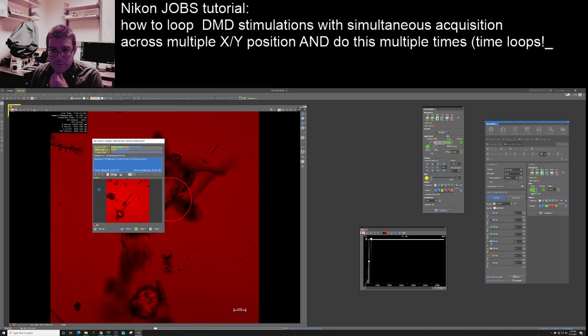Okay, so now we'll do this final third one, visit that location, do the stim. Visit a second location, image 1 second, stim, final imaging, and last but not least, visit there, stim, and go back. And it would do this 2 more times, and of course you could have it do hundreds of loops over this, you could have the acquisitions be more complex than this, but we'll just stop here.